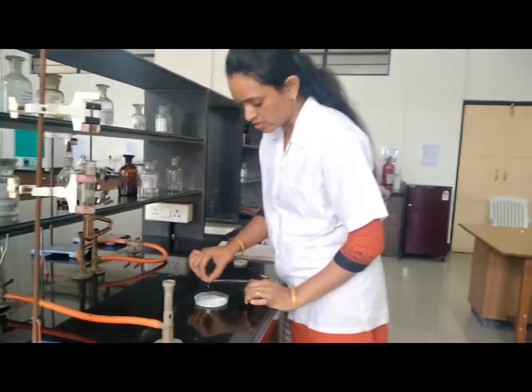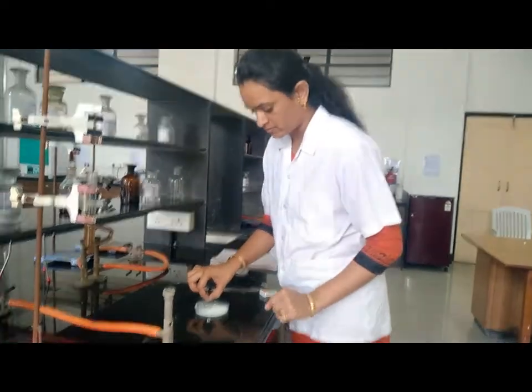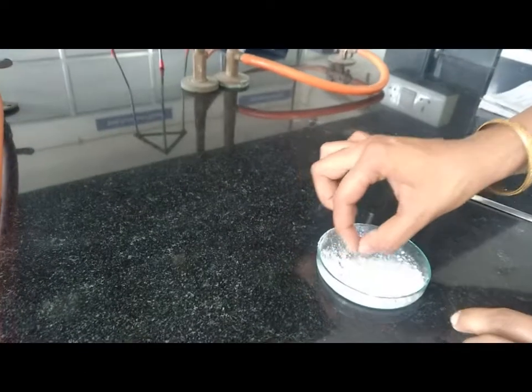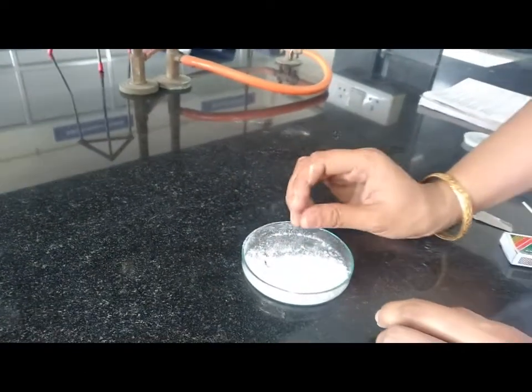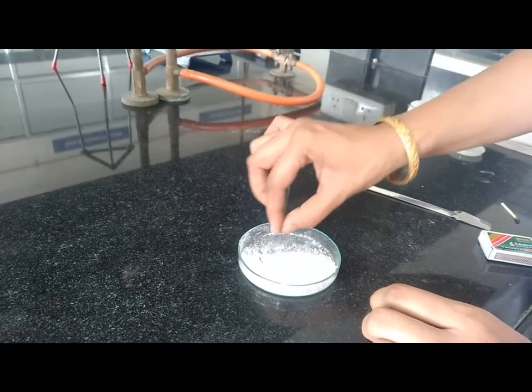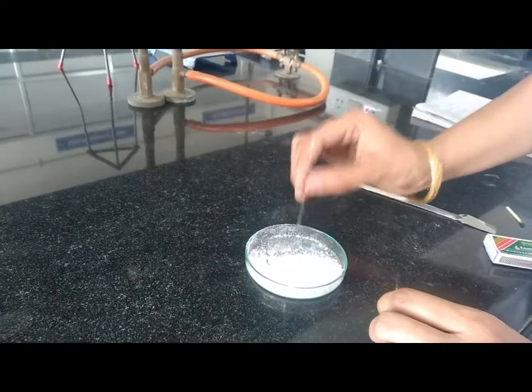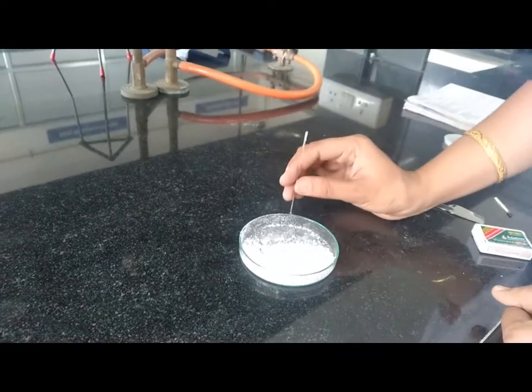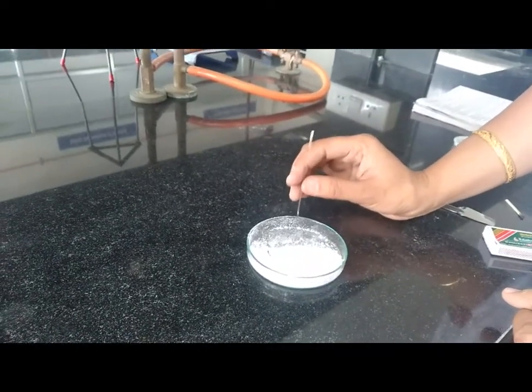First of all, insert the capillary like this so that the sample gets inside. Tap this on the wall of the petri plate.